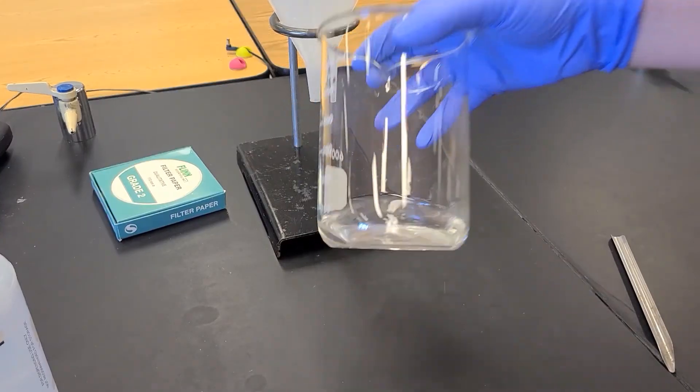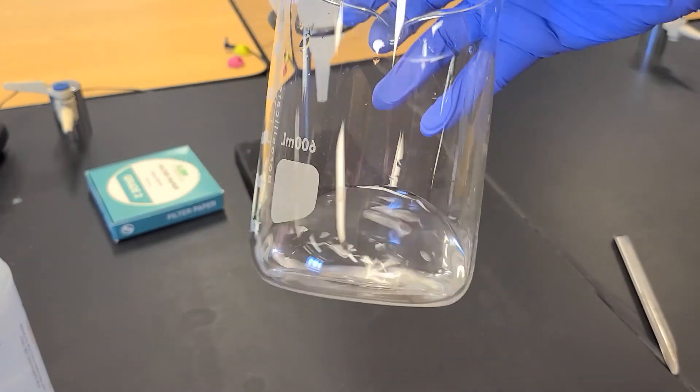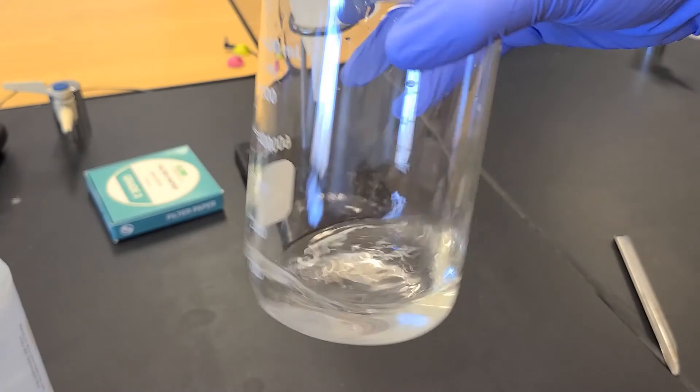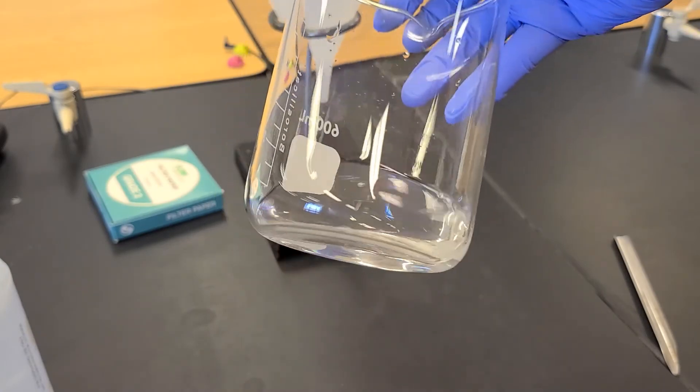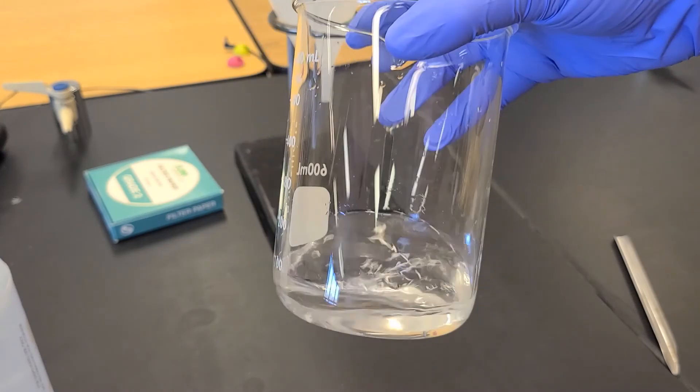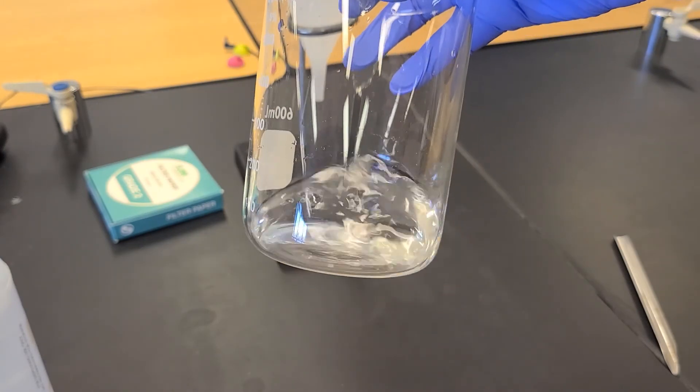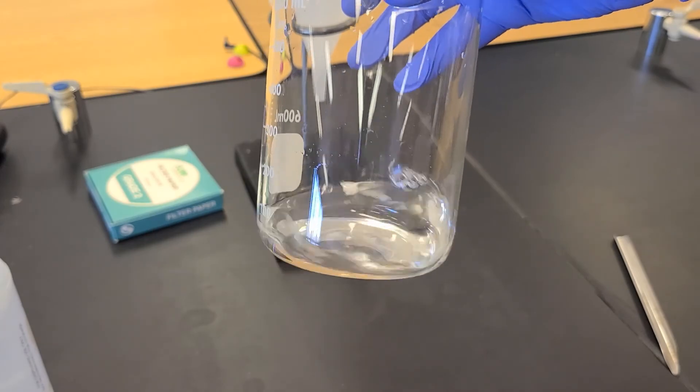When we take a look at the filtrate, we see that it's a clear solution, so I caught all of my solid. I can actually test this by adding a couple drops of the sodium carbonate solution. When I did, it remained clear, so I'm confident that I've reacted out all of the calcium that was present in the water sample.